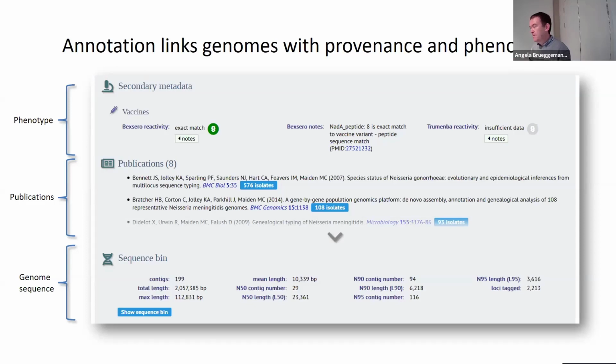The vaccines that have different protein components. We have a tool that can check whether that sequence exists in the genome, the exact peptide sequence, or the translated peptide of the gene. And we also know what exact variant is present within the vaccines, and also how cross-reactive it is with other variants. And we have a whole list of which ones are cross-reactive and which ones aren't.